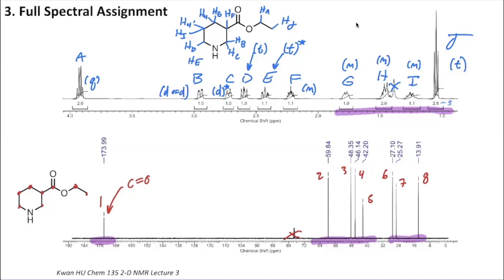So now to start sorting through this messy forest of hydrogen labels, I next want to look at the COSY information to see if everything we've assigned so far relatively makes sense, and look for some cross peaks that will tell us, oh yeah, the position for hydrogen F makes sense because we see these splitting peaks. And that hopefully will tell us if we've gone astray anywhere and help confirm the things that we feel pretty good about.